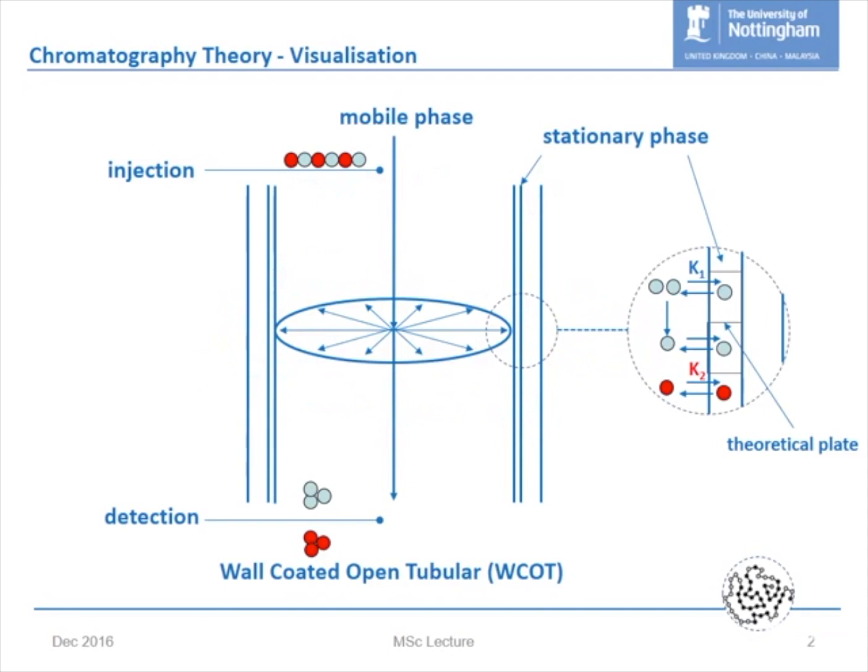Okay, so chromatography. This is just a general introduction to chromatography, some of the really important points that you need to be familiar with. And then what we'll do is we'll port that understanding across into the field of GPC, gel permeation chromatography. Okay, so probably everyone here is familiar with the concept and the separation process that's chromatography. Would that be reasonable?